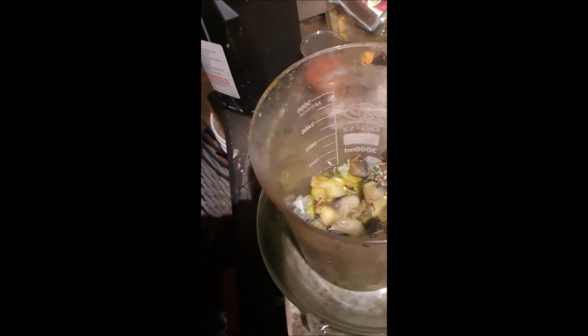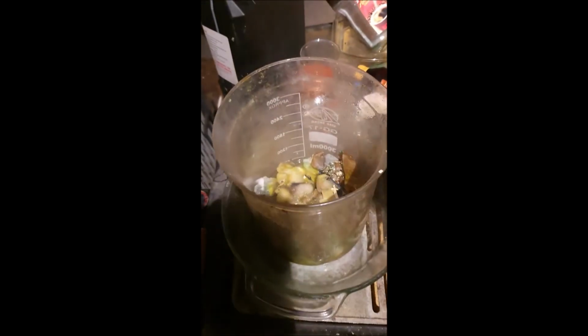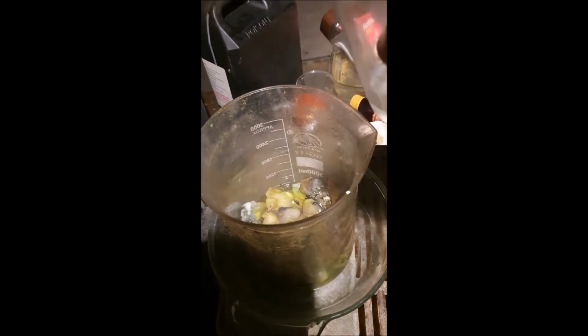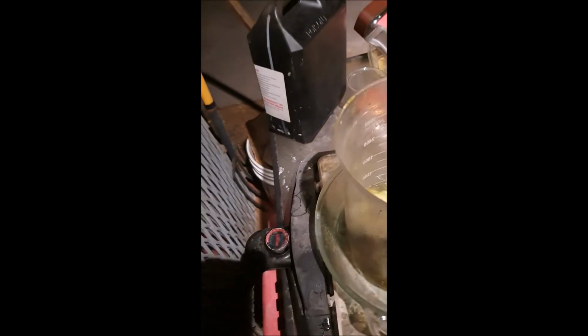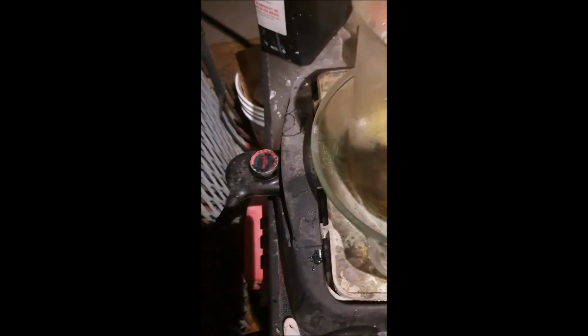But the main thing I want to show you guys, because this seems to be a common problem, is people going by recipes, you know, 3 to 1 whatever, and it's really not a good way to go. They end up with too much nitric, then they can't drop the gold, and then they end up asking questions on forums and so on. Seriously, all you need to do is a splash like that, and if you need some more later, put a little bit more, and then if you need some more, put a little bit more. Better to do that than to put too much in. You don't need it. So I'm going to put this on a bit of heat.